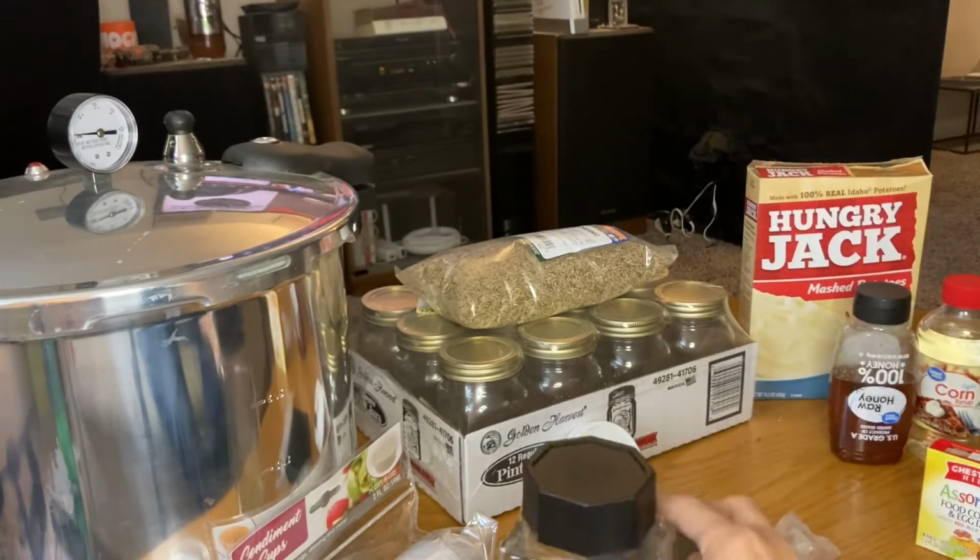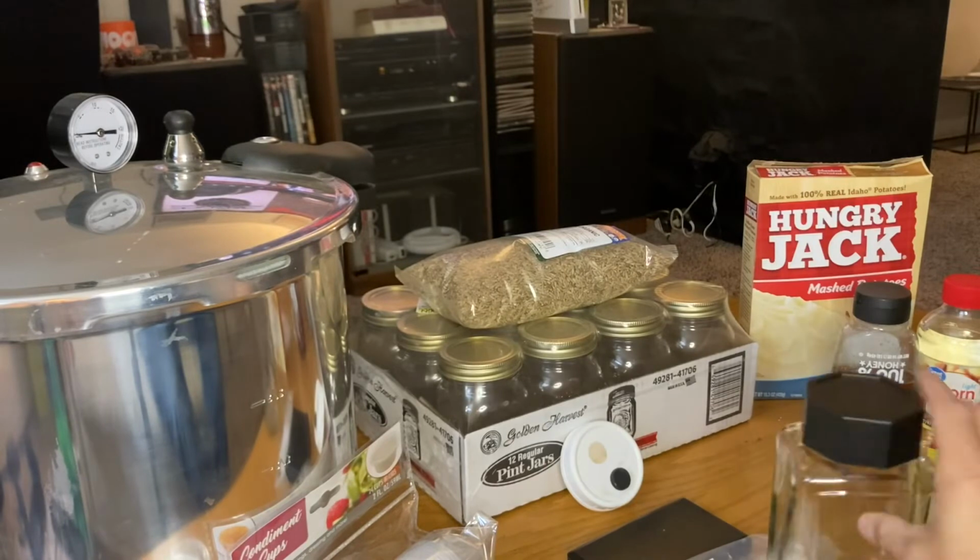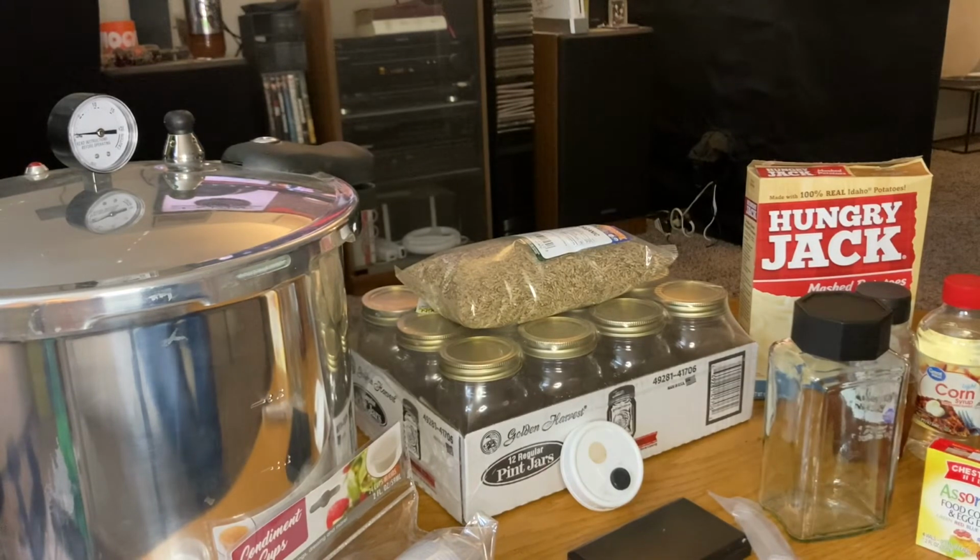You can use an electronic thermostat reader to read the temperature on the agar if you want to go that route, in order to know when it's going to start solidifying. Usually right around 100 degrees or lower is when it will start solidifying. But how I get around not having to do that is I will wait a few minutes for it to cool off, and I'll kind of touch it. And if it's too hot for me to really hold it, then I won't pour it yet. If I can only touch it for a second before it feels like it's going to burn me, then it's too hot. If I can hold it for about 5 to 10 seconds before it feels like it's getting really hot, then I know it's good to pour.